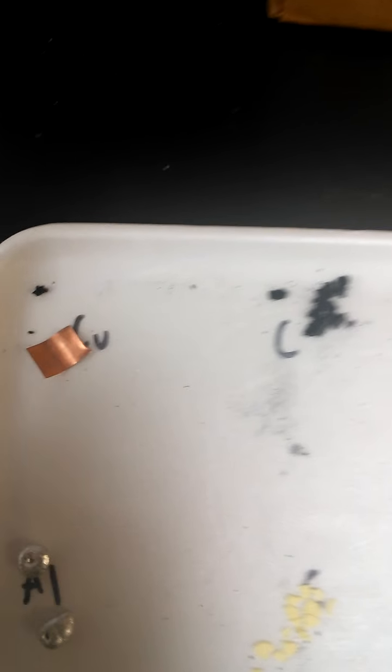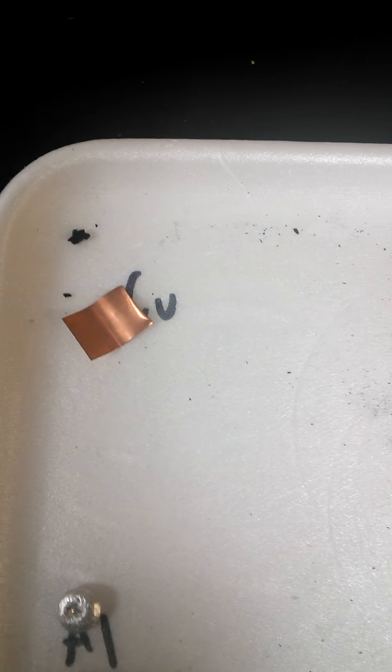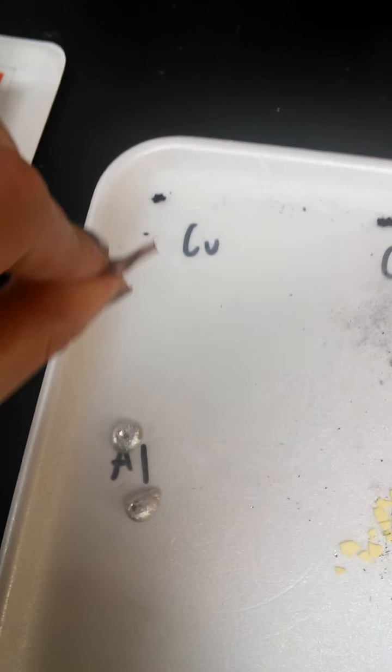Okay, so here are all our elements, and we are going to fill out this chart based on all their properties. So our first element up here is copper. The color is kind of pinkish brownish. It is malleable and it's ductile. Our second element is carbon. It is black. It can be crushed easily, so it's not malleable or ductile.